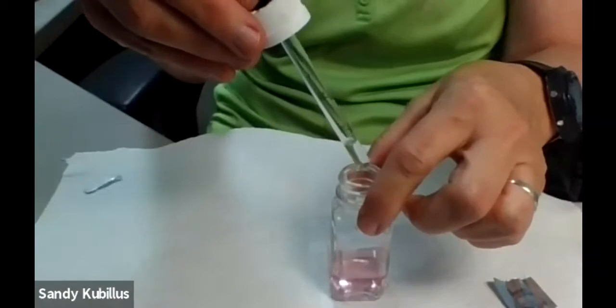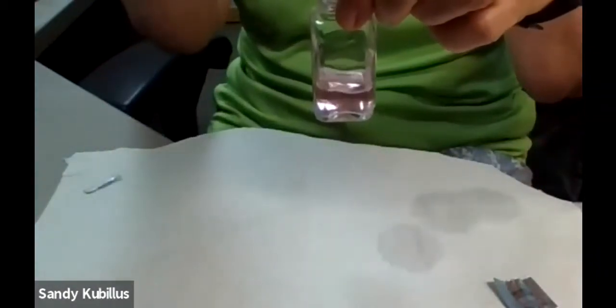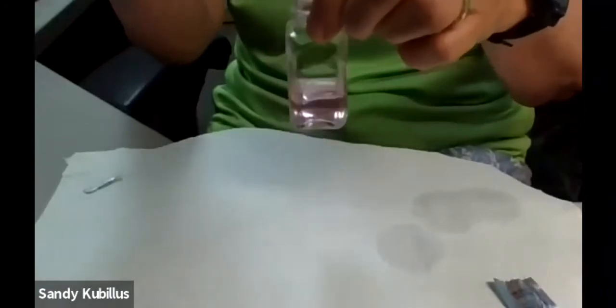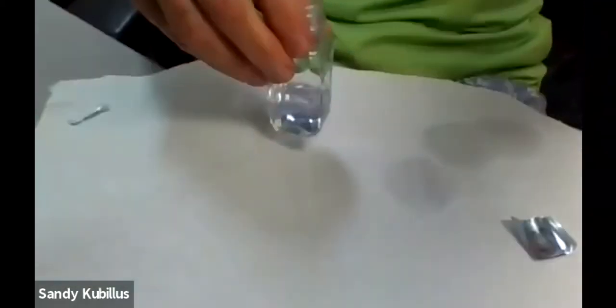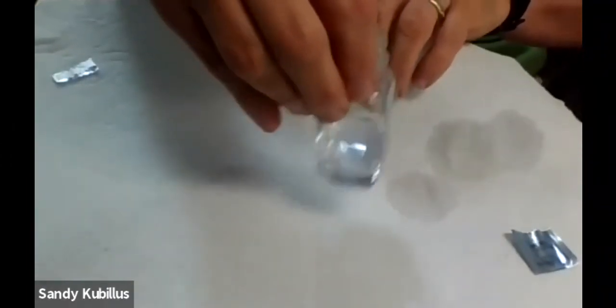3, 4, 5. I know it's going to take a fair amount to get it that high. 6, 7, 8, 9. Notice how I'm shaking it in between. 10, 11, 12. Oh, all of a sudden it's 12. Notice how it's no longer pink. So it's turned a bluish color. So that is our answer.